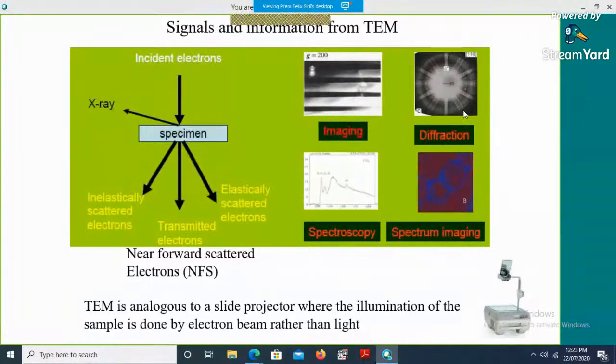You can capture only two-dimensional images by using TEM. So you cannot study the topography unlike in SEM. You can study the morphology to a certain extent, not fully. Say, for example, your nanoparticle is spherical, but it has some three-dimensional features, like one side being triangular or pyramidal. Those kinds of features cannot be studied by TEM, but of course you can do such imaging using SEM.